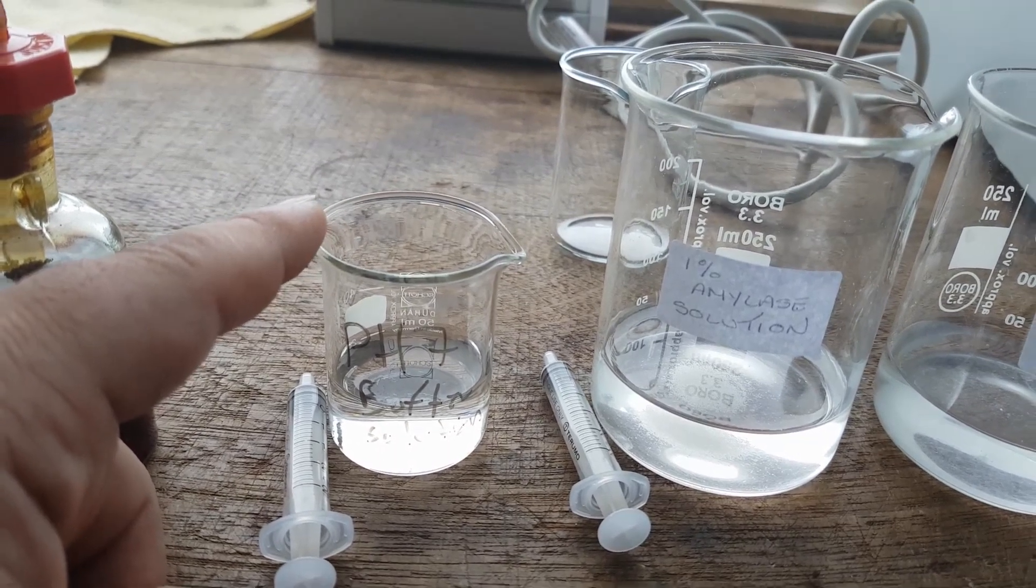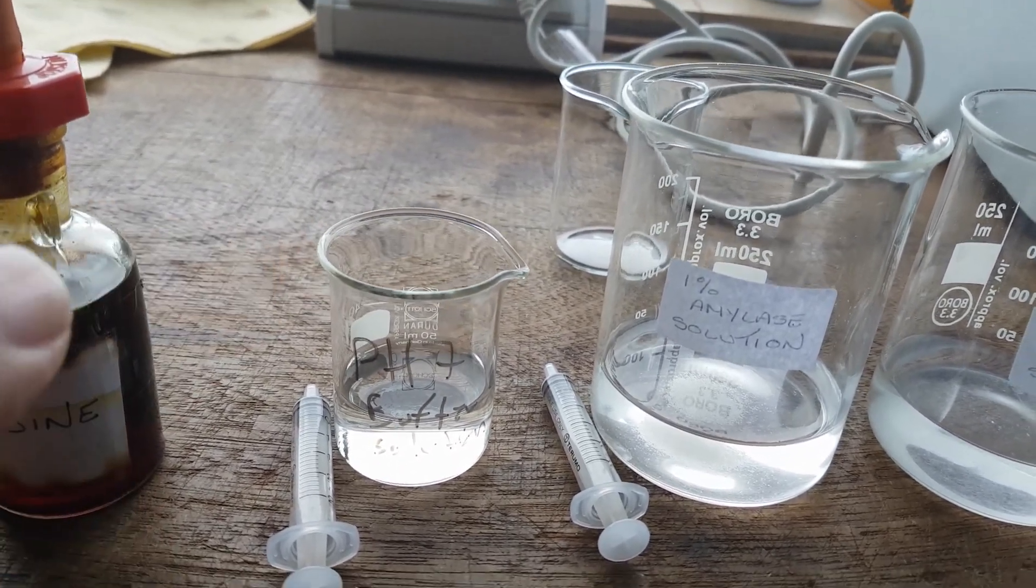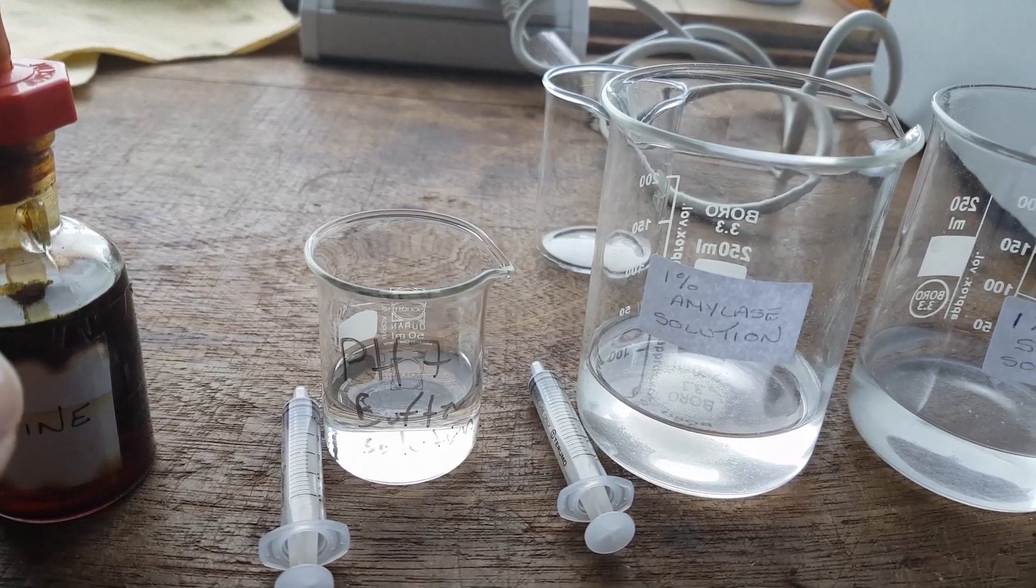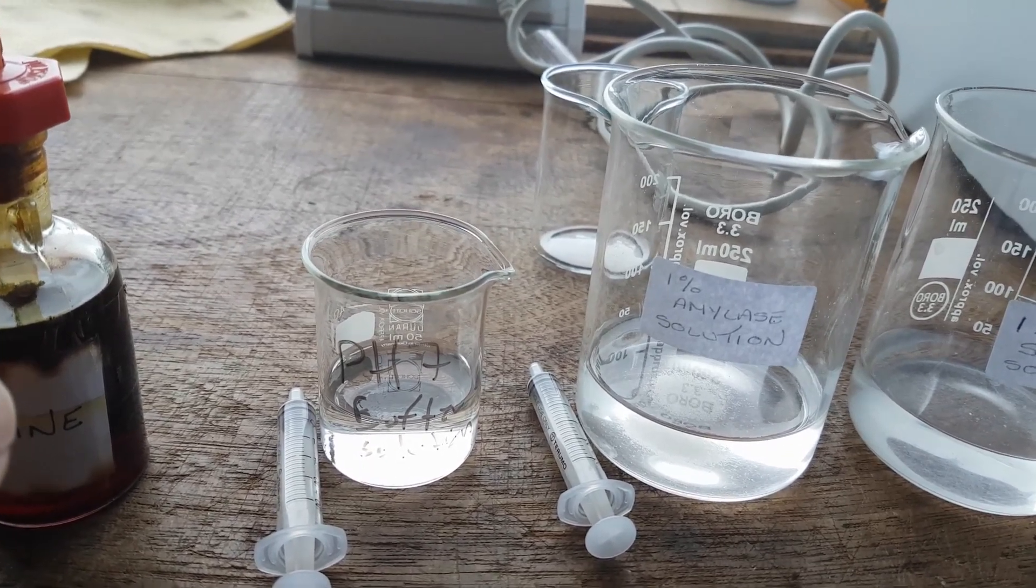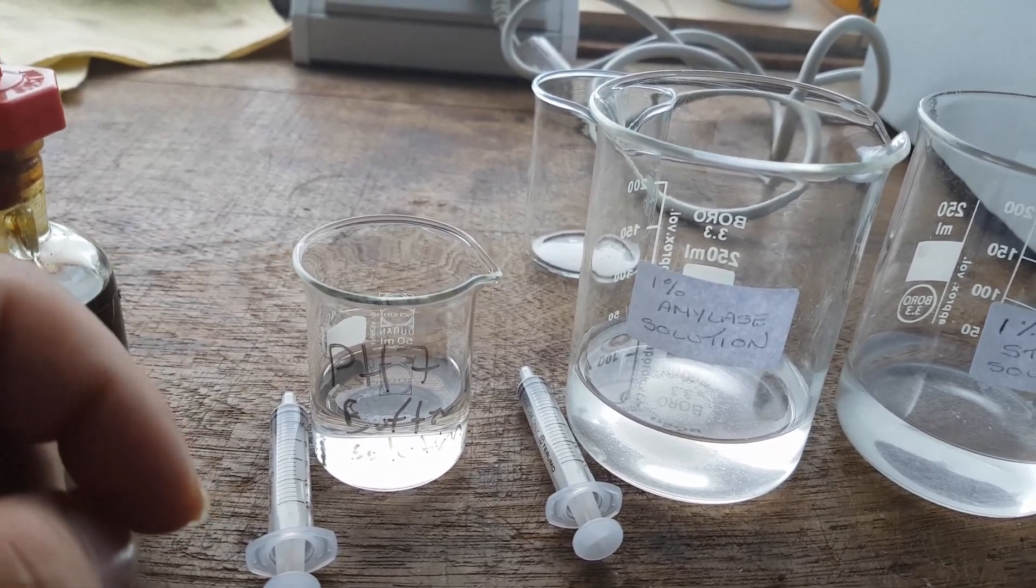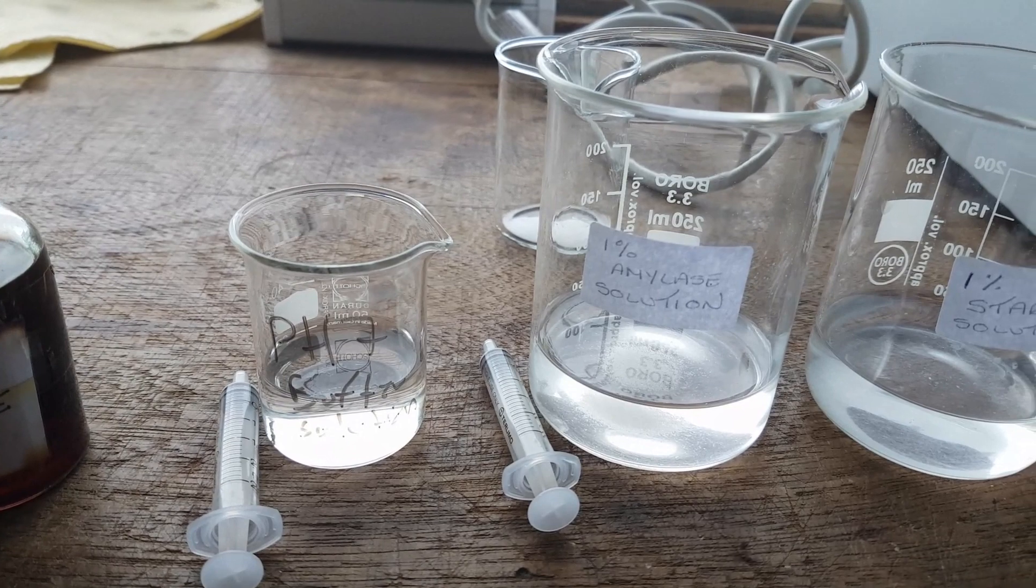so we're going to have different pH buffers. This one happens to be pH 7. A pH buffer is basically a solution which does not change pH readily. So in other words, this will stay close to pH 7 as much as it possibly can. So that's what a buffer solution is.